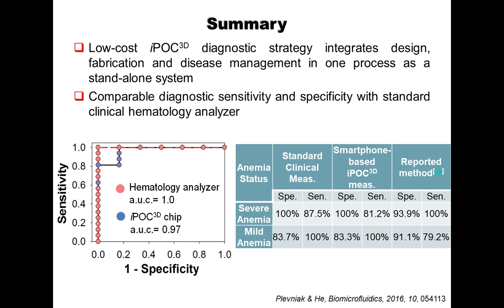So overall, this technology actually introduced a low-cost POC diagnosis strategy for anemia and also for disease self-management, which can form in one process as a standalone system. And this has comparable diagnostic sensitivity and specificity with a standard clinical hematology analyzer.